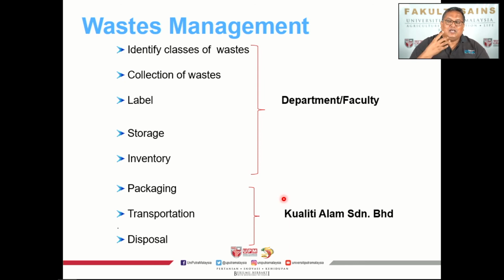Think about your reaction fully. Are there ways of reducing your waste? Is that the best procedure that you can actually use? Maybe there are other routes. This is something you need to sit down and discuss with your supervisor.